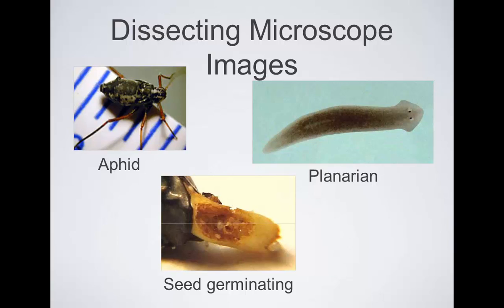So do a little test here with me. Close one eye, close your left eye. Put your finger close to your right eye, in front of it. And then switch eyes. Close, open and close your eyes. You've probably done this before, right? Has everyone done this, or is it just me? Okay, so what seems to happen? When you look at it with one eye, it's sort of right in front of you. When you switch to your left eye, where is it? Off to the side.